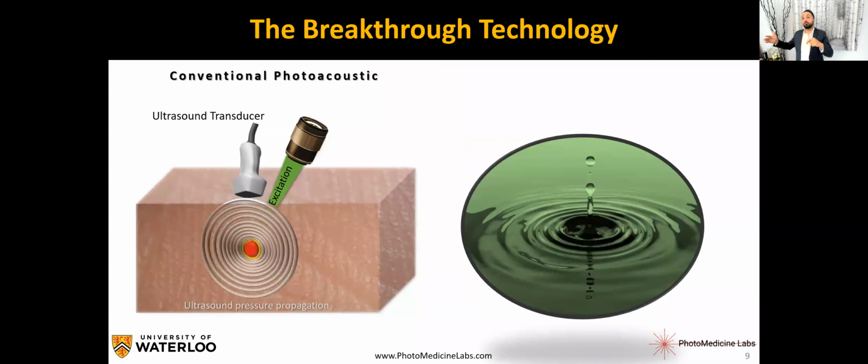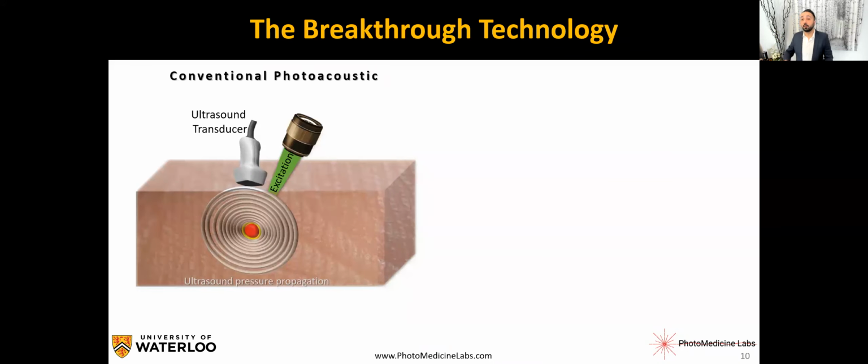One is waiting at the shore with an ultrasound transducer and gel for the sounds to come to us, or use PARS technology and go to the origin, only collect a few hundred nanoseconds, or just collect the initial pressure every time that the stone, in this case our pulse laser, hits the surface of the water. So in other words, with PARS, we want to detect only the initial pressure, those shock waves.